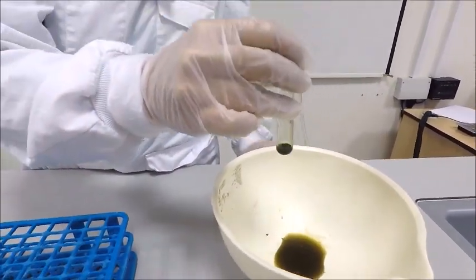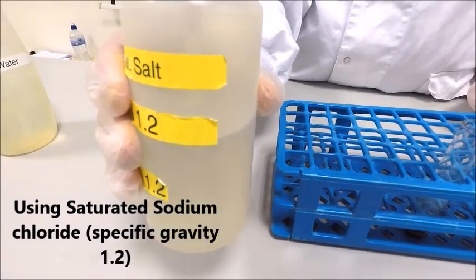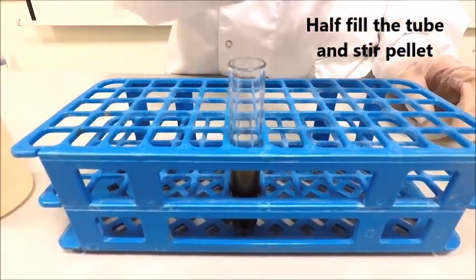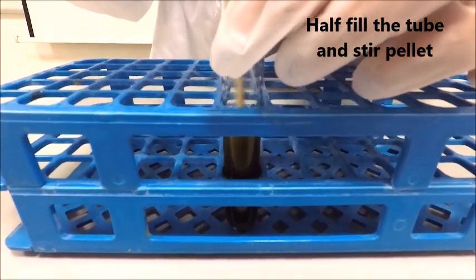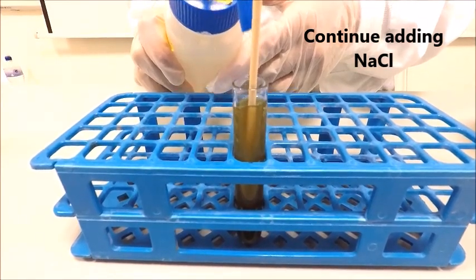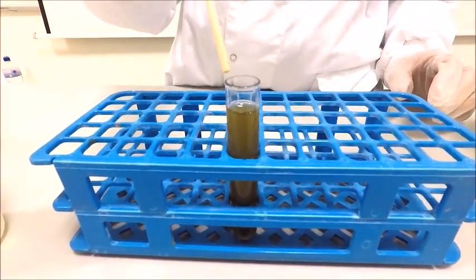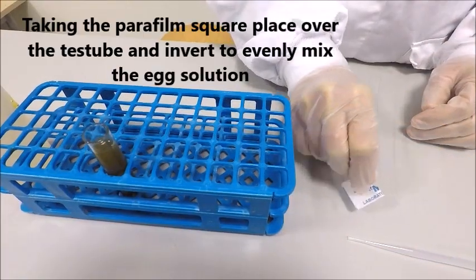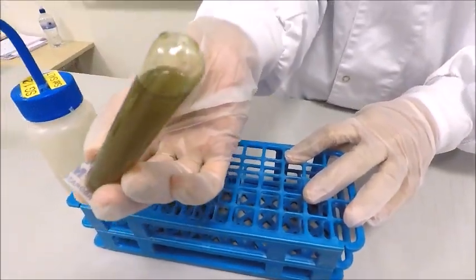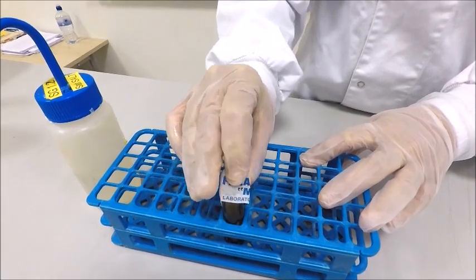Pour off the fluid, retaining the deposit at the bottom. Using your saturated sodium chloride, half fill the tube and mix the deposit with your applicator stick. Continue to add saturated sodium chloride until the amount added is equal to the amount of fluid poured off. Using your parafilm, gently invert the test tube several times until the mixture is homogeneous. Any worm eggs present are evenly distributed throughout the mixture.